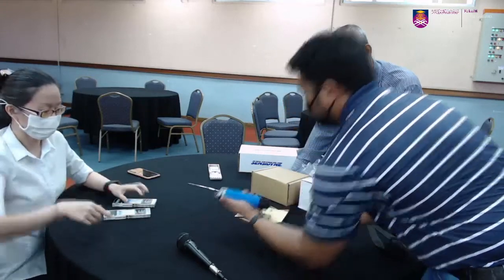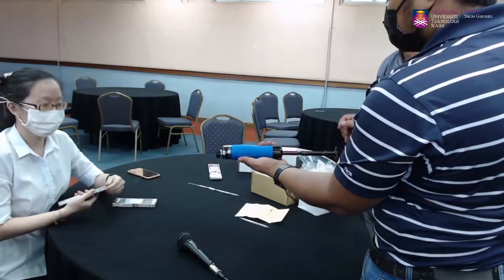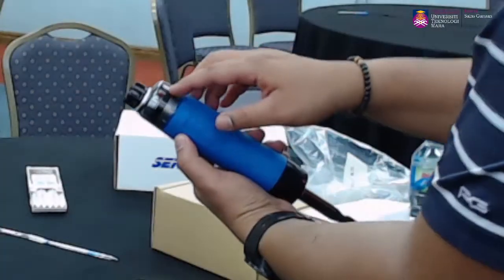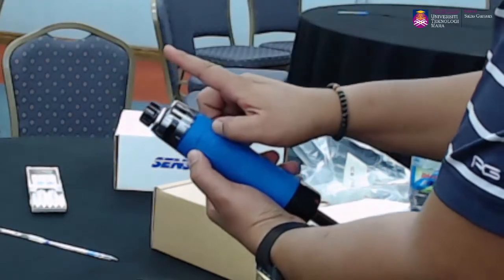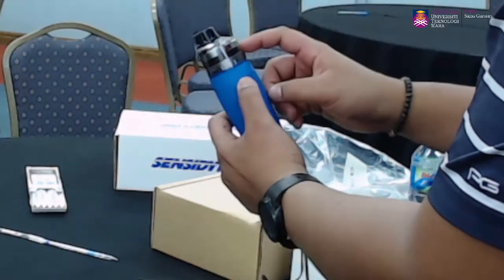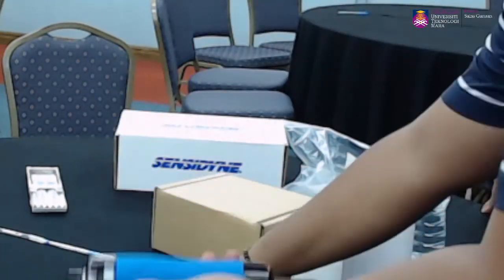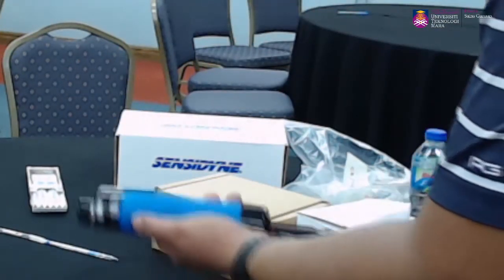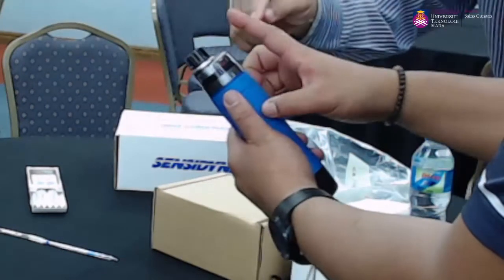Okay. So bila kita dah tarik sampai habis, kuat, indikator ni akan tunjukkan kita. Once kalau contohnya dah seminit, dia akan keluar. Bila dia dah keluar tu, means dah habis 1 minit. So kita nak go for stroke yang kedua dan ketiga. Satu tarik, satu stroke. Dia akan pop out keluar.